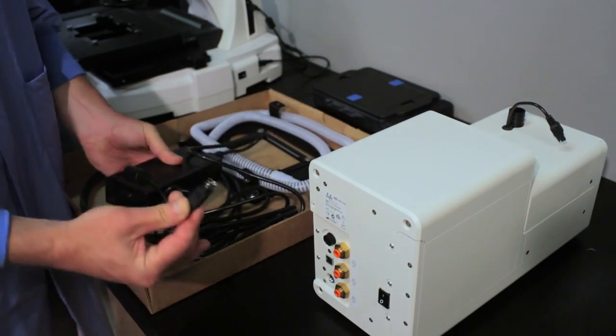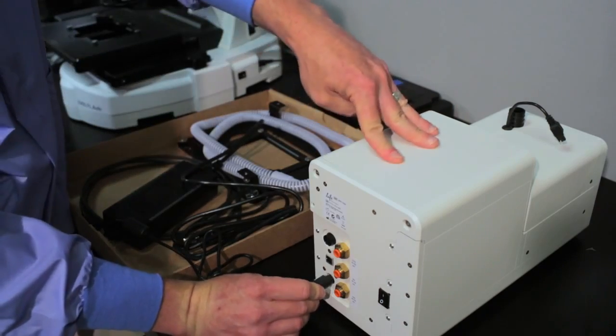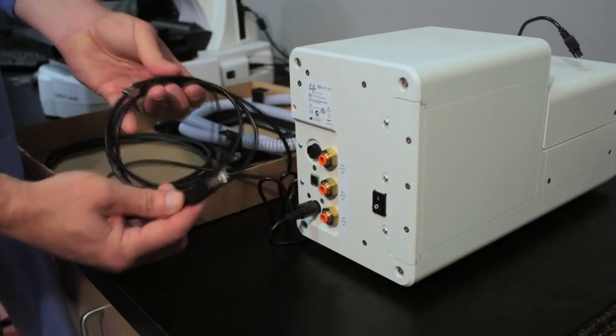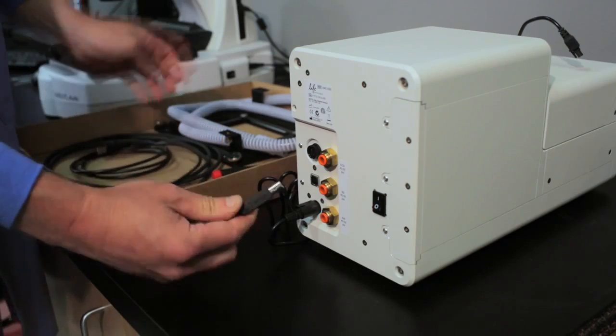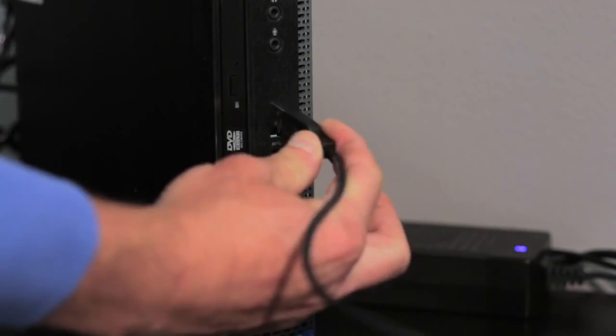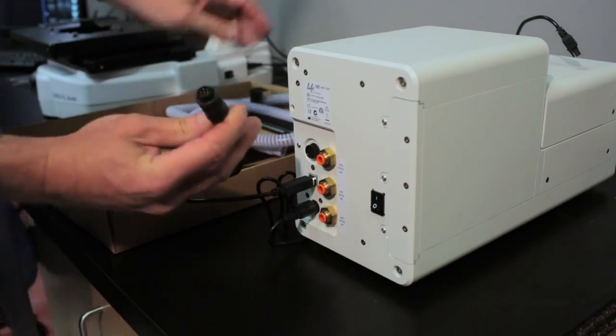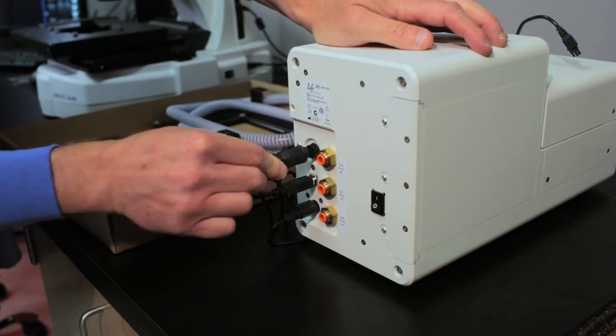Connect the power supply to the rear of the control unit and plug it into an outlet. Connect the incubator to the EVOS FL Auto System from the rear of the incubator to any open USB port on the computer base. Connect the data cord to the On-Stage Incubator.